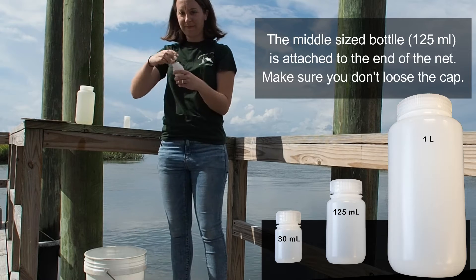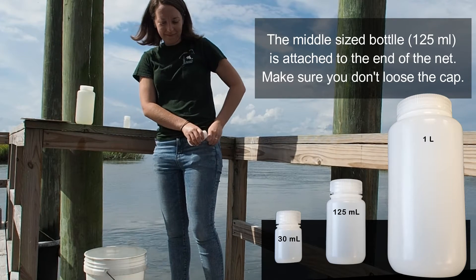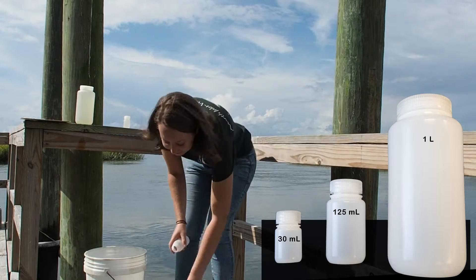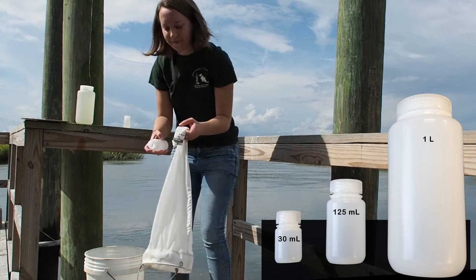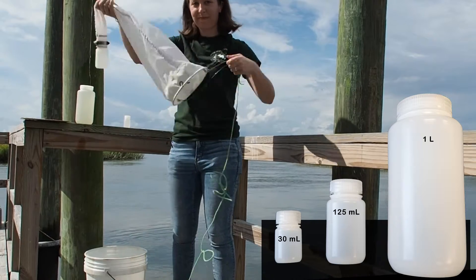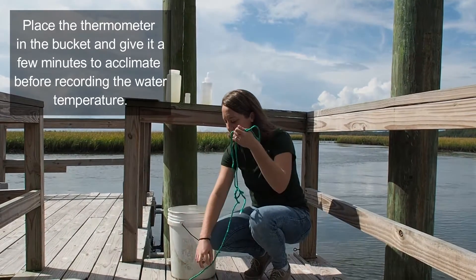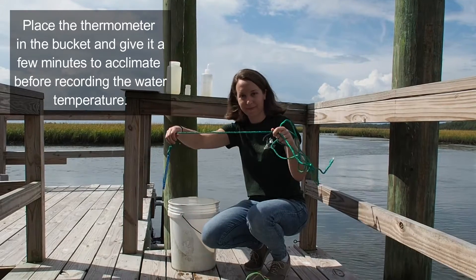The middle-sized bottle is attached to the end of the net. Make sure you don't lose the cap. Place the thermometer in the bucket and give it a few minutes to acclimate before recording the water temperature.